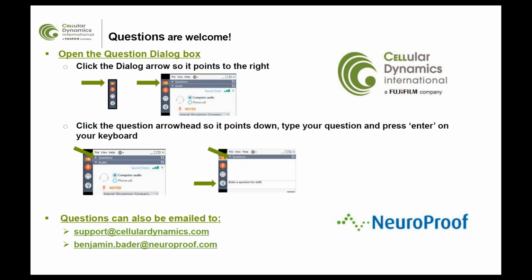Blake, you want to add? Yeah, no, similarly, we've done some work on excitotoxicity within CDI as well as other customer sites. And there was a poster presented at the 2017 Society of Toxicology meeting by one of our customers that delves into that. So we do see the cells being used as a model for excitotoxicity as well as seizurogenesis. And feel free to drop us an email and we can follow up in detail on that.